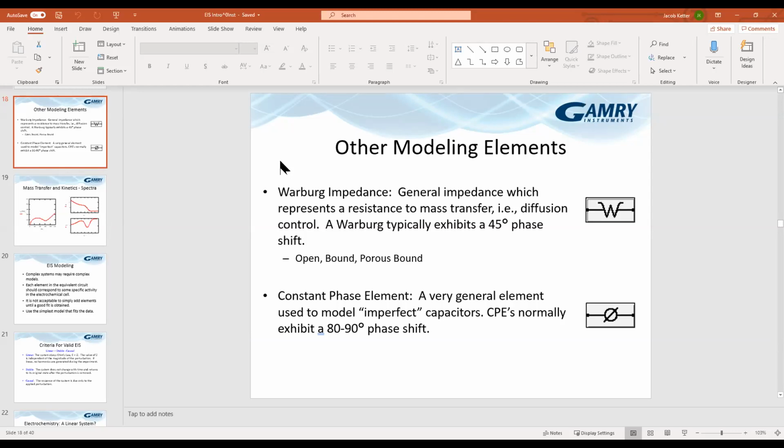So if you're measuring conventional, whether it's a sensor or corrosion or small batteries like coin cells, there's not enough power in there to really concern yourself with it. But if you are measuring larger batteries, fully charged, kilofarad plus supercapacitors, fuel cells, maybe electrolyzers, depending on exactly what you're doing, or if you're measuring in parallel with an electronic load or power supply, which you can do because our potentiostats are all floating, you can actually make those measurements.